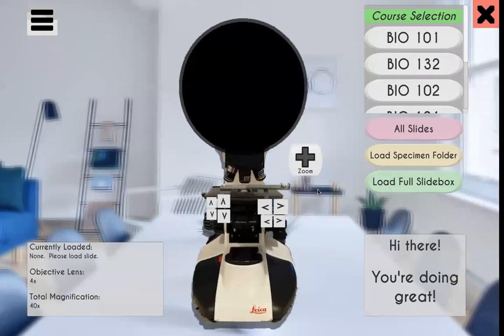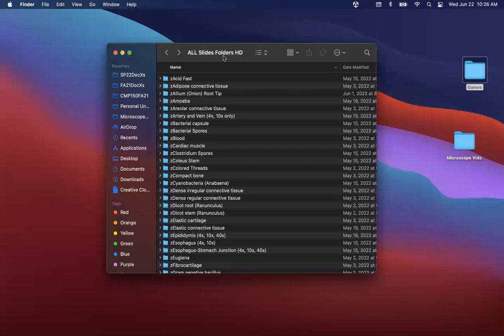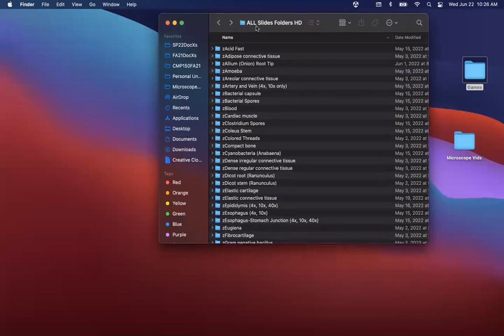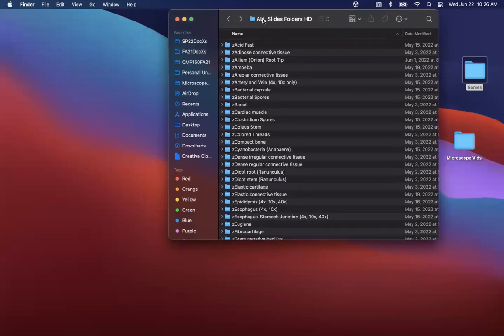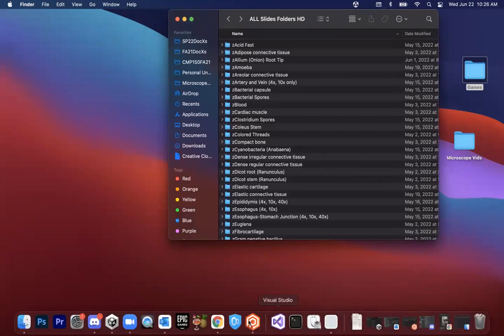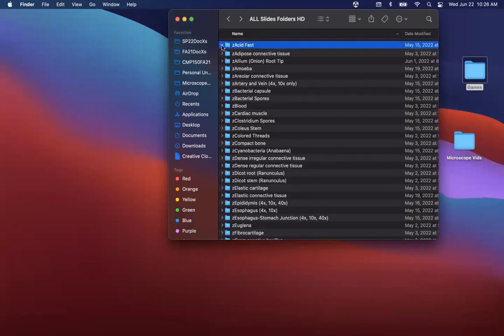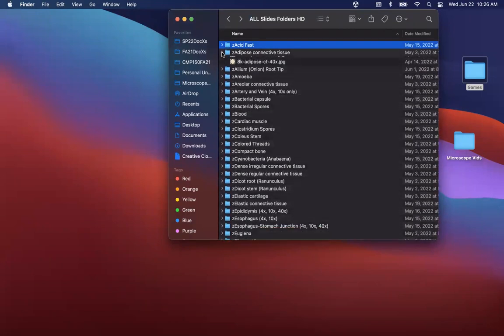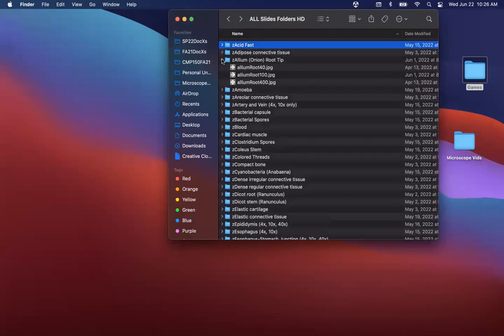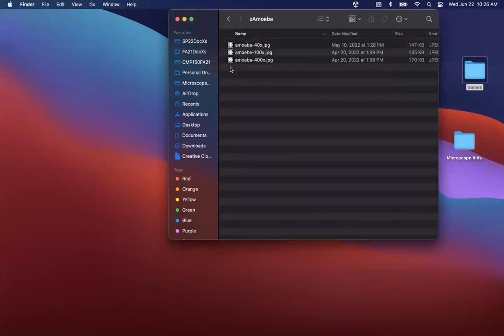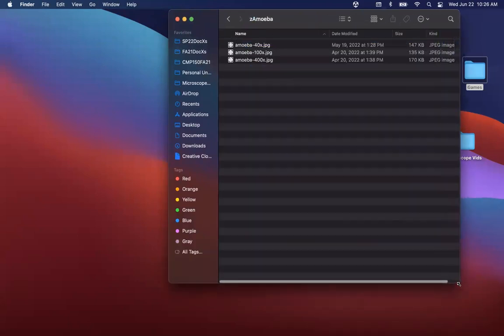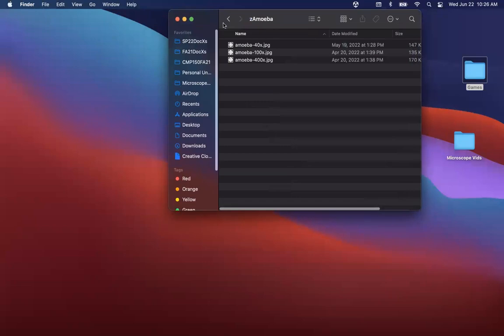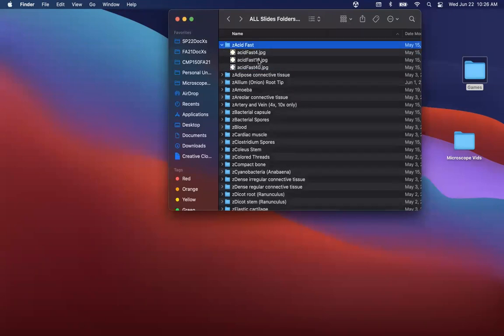So the first thing you want to do is be able to have some specimens or an entire slide box on a folder on your computer. So what we have is I have a whole bunch of specimens, and these were pictures taken by my colleagues in three different magnifications. In theory, it'll work with only one magnification or 100, but typically you have three to four magnifications: four, 10, 40, right?